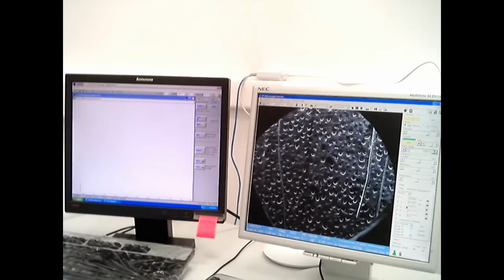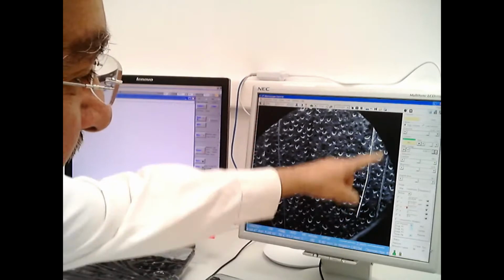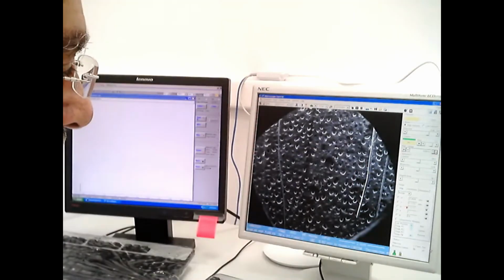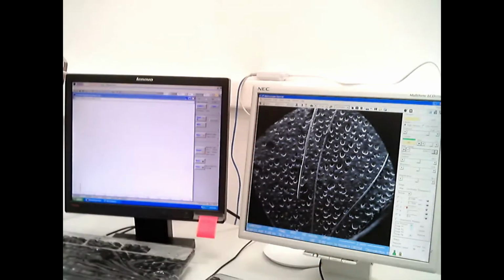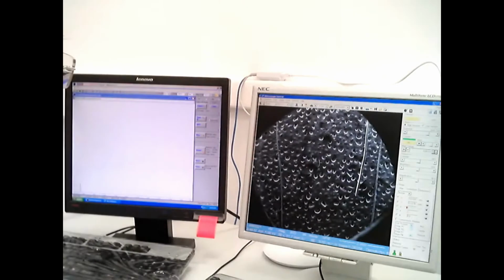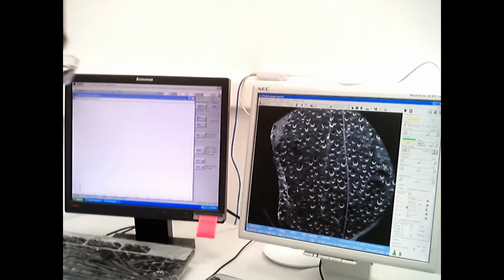This is another human hair. Another thing about cat hair is that it is extremely straight. So this is curved, so this is probably human hair, and this one is probably human. Let's see. No, this is a cat hair on the left or the right there. And anything else? No, we don't have anything else. So this is probably human. It's thin.